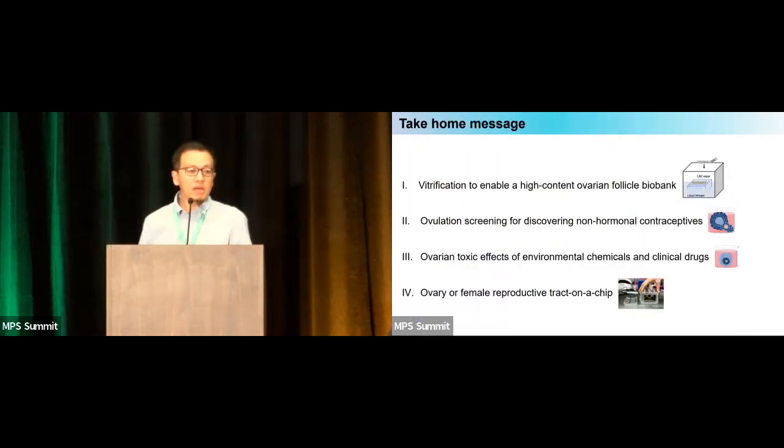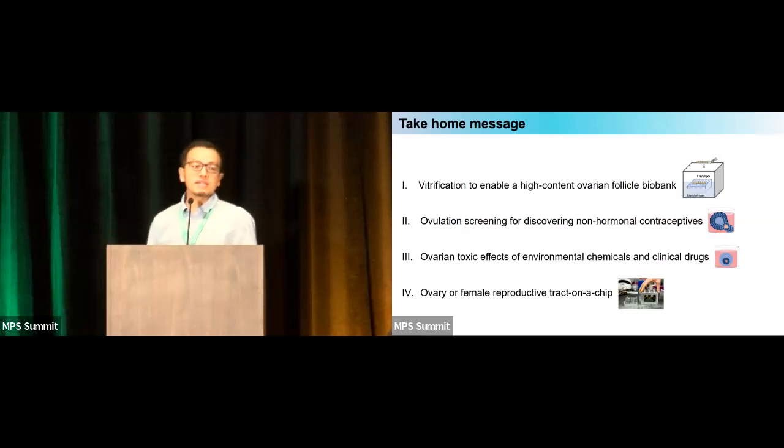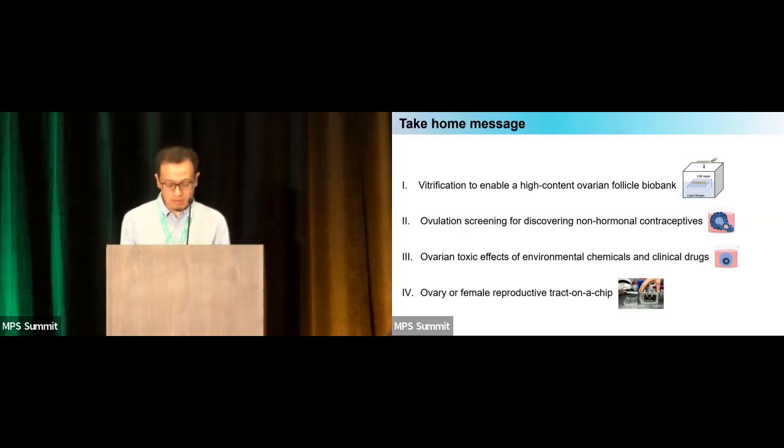So overall, I hope based on this result, I can convince you that the mini ovary model is a pretty cool and also pretty powerful model for us to study, for example, fertility preservation, the development of novel birth control pills, and also to study ovary biology, toxicology, and the whole female reproductive toxicology.